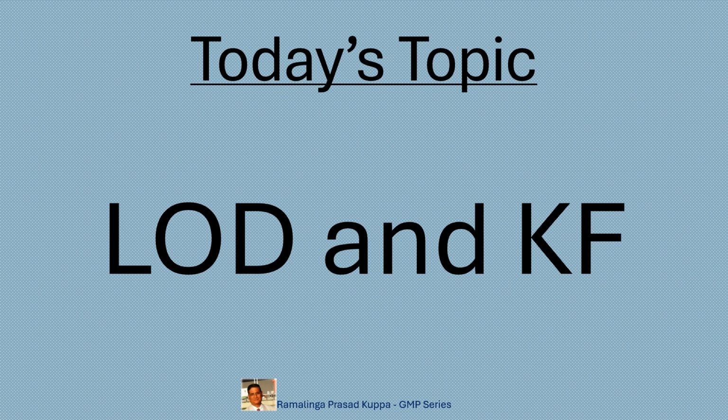Today's topic is LOD and KF. Loss on drying, which is abbreviated as LOD, provides information on all residual volatile matter in the product. LOD includes any traces of water content in addition to other potential organic solvent residues that are likely to be present in the final product.